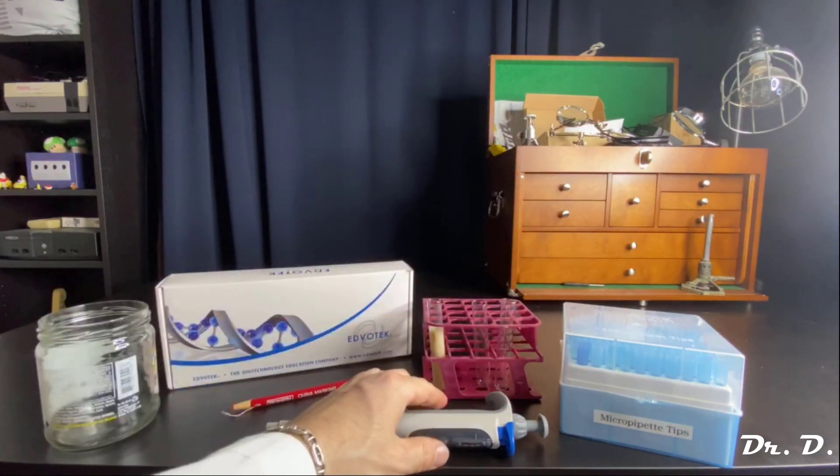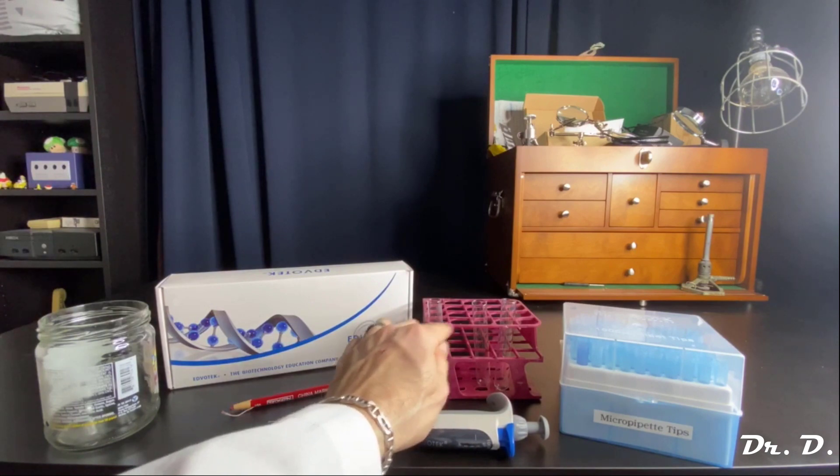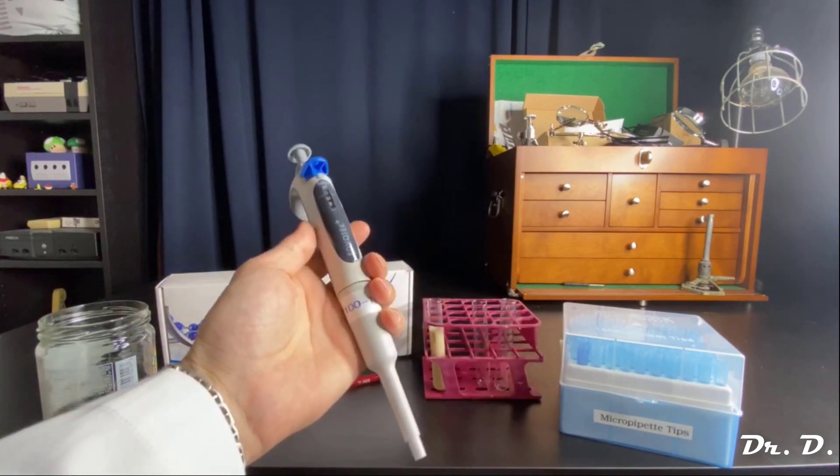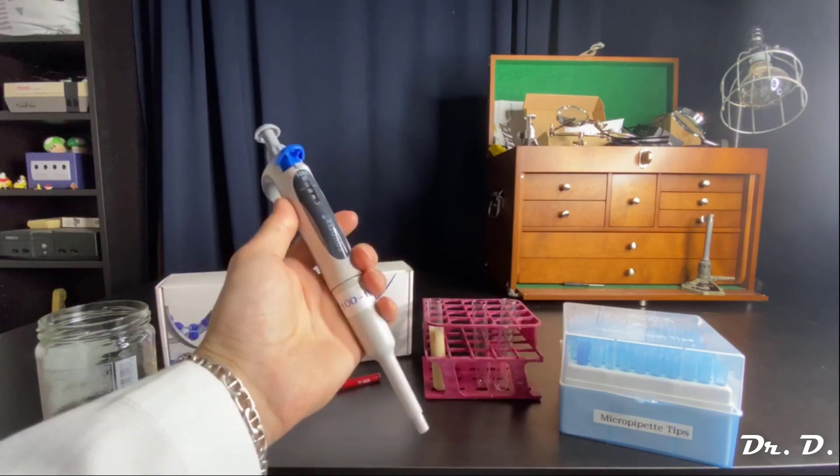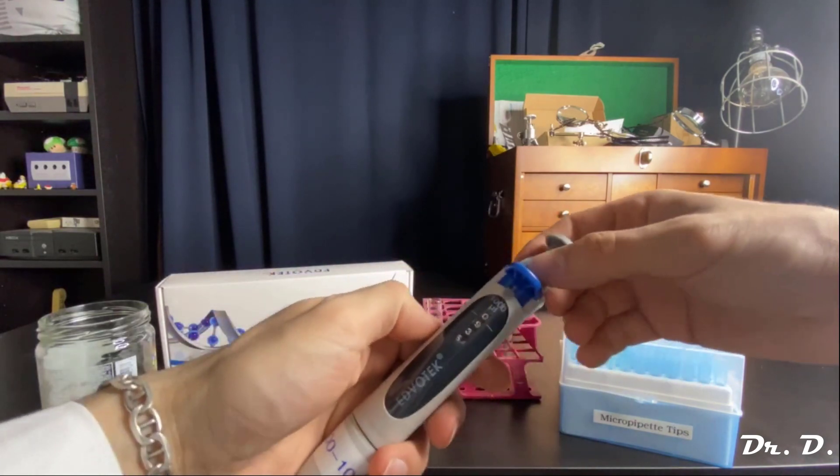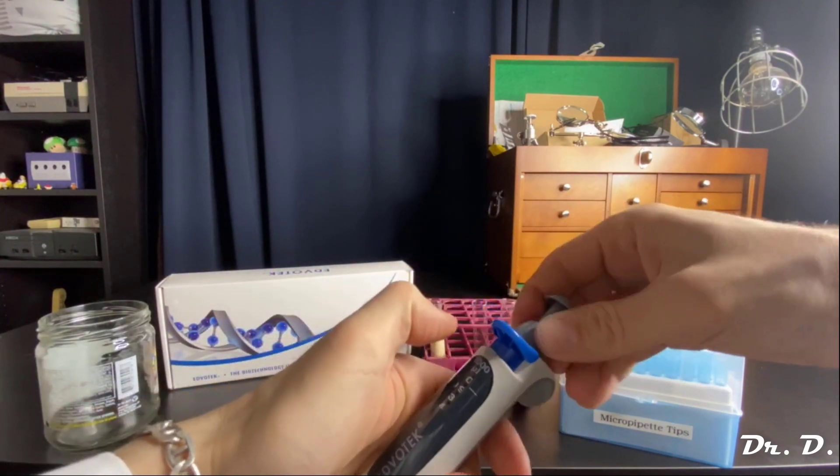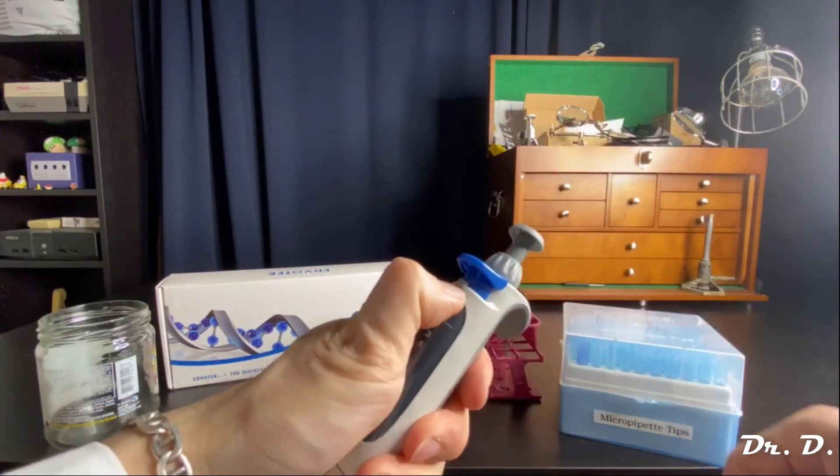I want to put, let's say, 500 microliters from tube one into tube two. How do I do that? First of all, I take my micropipettor and remember it might be locked. Right now it's not locked, but remember it might be locked. If it's locked, unlock it.